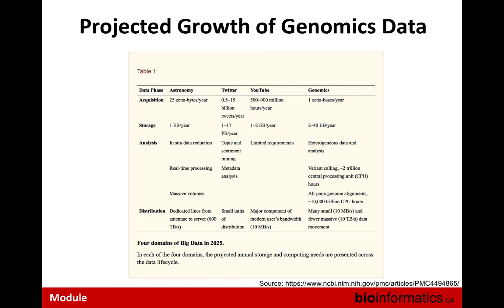This is what we have to think about in the future. How are we going to capture this data and, one, link it to EMRs? But even more than that, how are we going to manage the data in the first place? Already, when we talk about clinical labs, we have to store the data and archive it for how many years? That's an unknown. And how can you retrieve a particular patient record if they want to go back and look at something again?